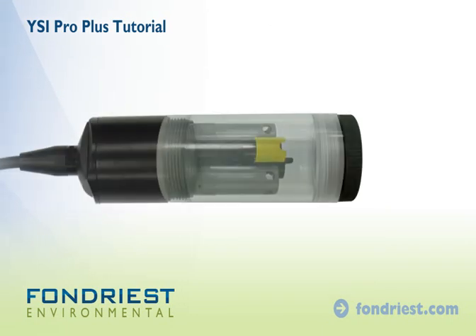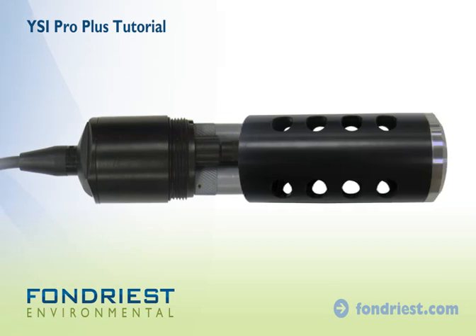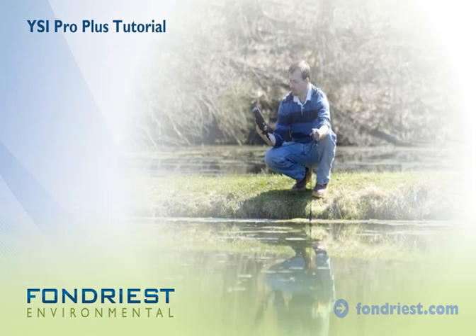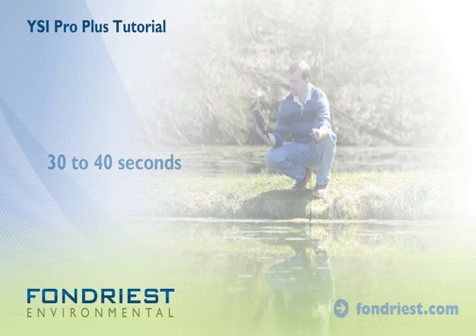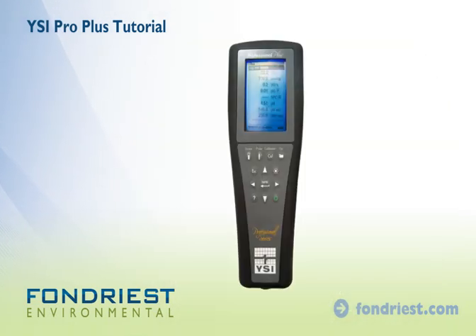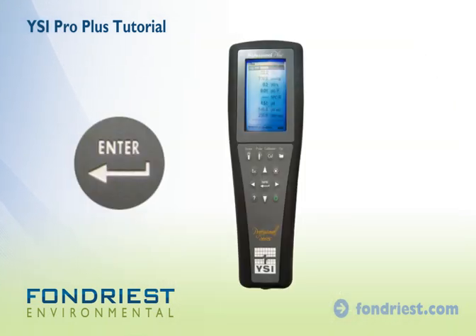To begin sampling, remove the probe storage chamber and install the probe guard. For surface water and downwell applications, submerge the probe to the desired depth and allow the sensors to equilibrate. This may take 30 to 40 seconds. Note that the dissolved oxygen sensor requires stirring, so be sure to move the probe while sampling. Press enter to log the readings with a date and time stamp.